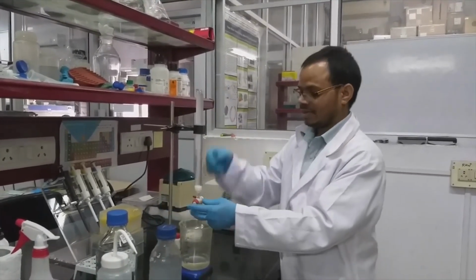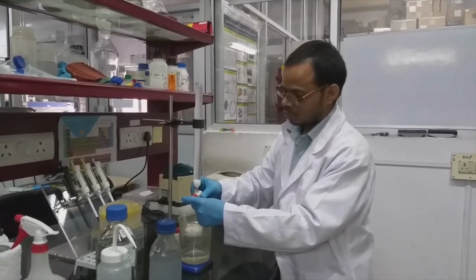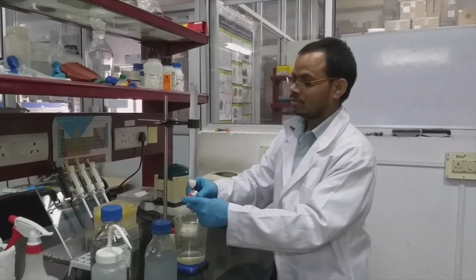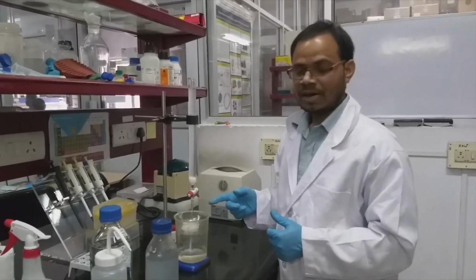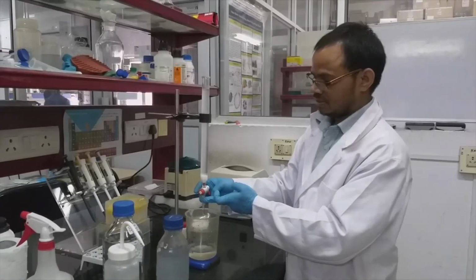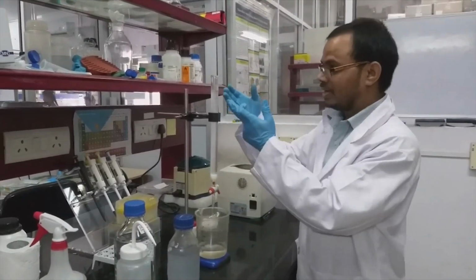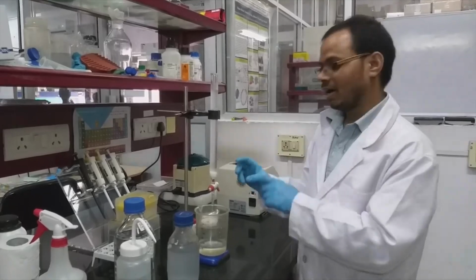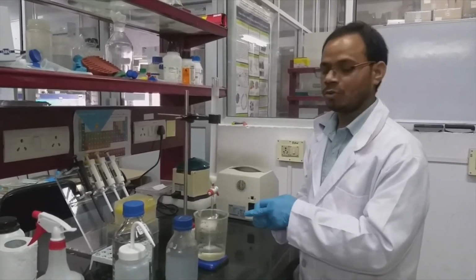So while the settling is going on, you can open the column. The flow should be slow, otherwise, because the diameter of this outlet opening is very high, it will completely come down, so it will give cracks in the column packing. So we are releasing the buffer very slowly.